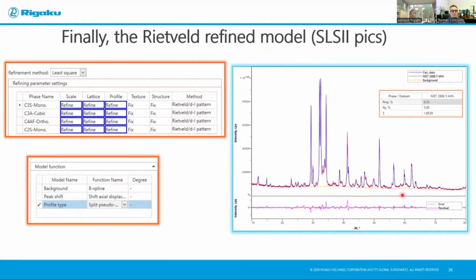And then there are mathematical parameters such as Rwp, Rp, S. Rwp, for example, stands for residual weighted profile. Remember the equation 1 I showed you with the picture of Dr. Rietveld? R is the residual. How close is my model to the actual data? And lower the better, like below 12 in Rietveld refinement. S is goodness of fit. 1 is like perfect. We don't want to be perfect. It's not possible ideally. So somewhere in the range of less than 2, for example. Now, these numbers are more flexible based on the quality of data. So there is not a general saying you have to have a number before I will accept your publication.